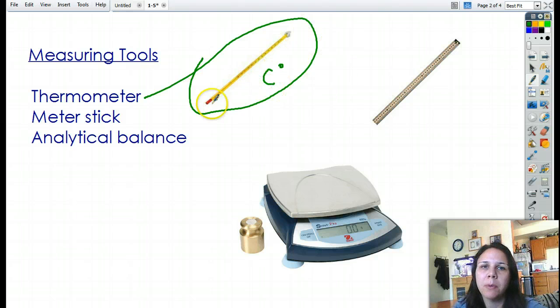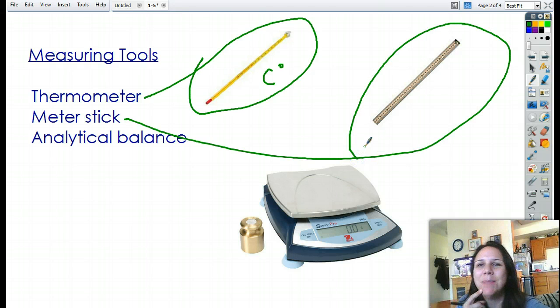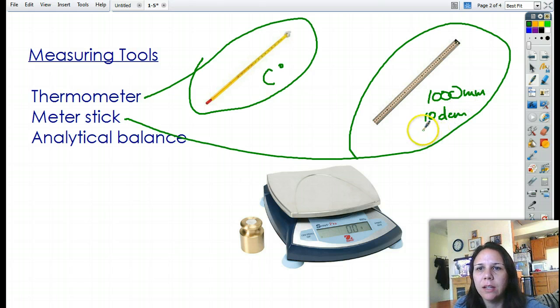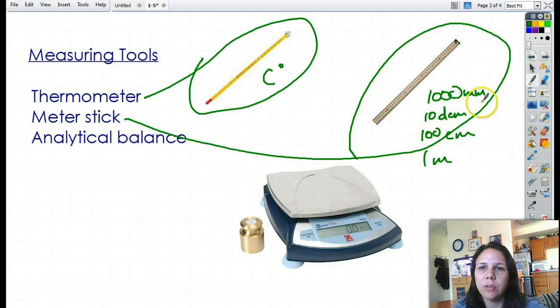All of our thermometers will always be in Celsius. We have a meter stick — not a yardstick, that doesn't count. It's a meter stick with one meter or a thousand millimeters, ten decimeters, and a hundred centimeters. All of our measurements are in metric, so this will all have meter in it somewhere.